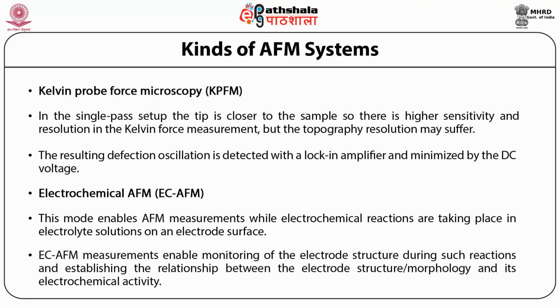EC-AFM measurements enable monitoring the electrode structure during such reactions and establishing the relationship between the electrode structure or morphology and its electrochemical activity. As this mode occurs in aggressive liquid environments, excellent environmental control and protection of AFM electronics is necessary for effective imaging.